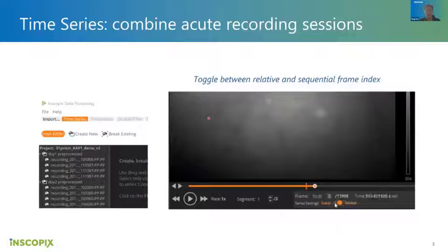For example, you want to give the mouse time to rest, so there will be a gap between sessions. For other cases, you might want to compare before the drop, so there we naturally introduce some gap. Yeah, and then you can concatenate those movies into one session.